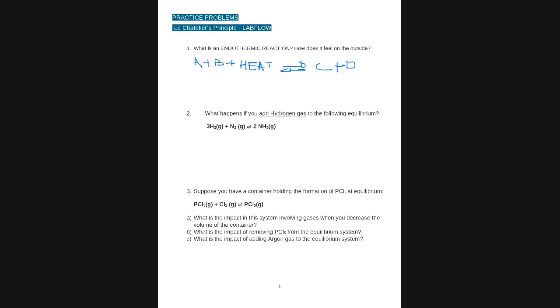Now, how does it feel from the outside? Feels cool. Yes, awesome. Thank you. Yes, exactly. A bit chilly. That is totally correct. When the system absorbs, it feels cold from the outside. When the system releases, it feels hot. That is correct. Awesome. Let's look at the next question.